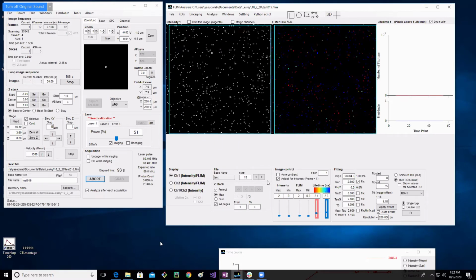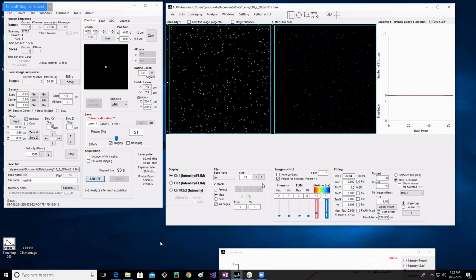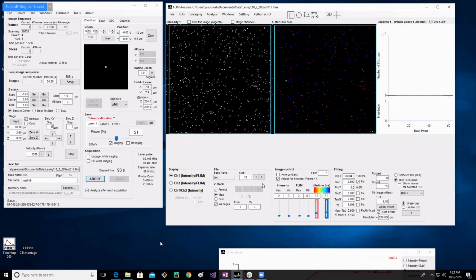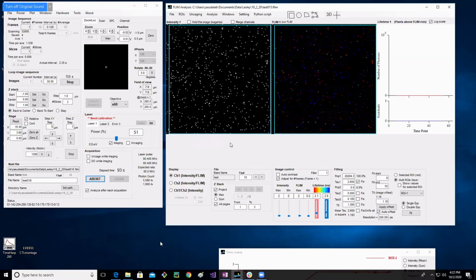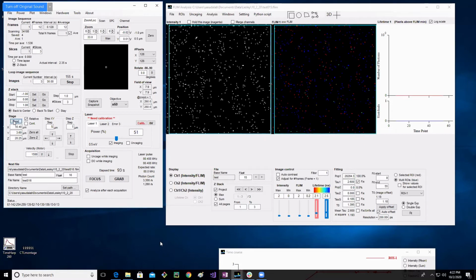Okay, right there. Can you guys see that? The noise increased a little. Okay, and that's when the laser is starting to go into the slice. I can see the noise levels increase. It's not super accurate, but it's a quick way of sort of getting an idea. So now I can hit read, and now I can see that I was 20 microns before.